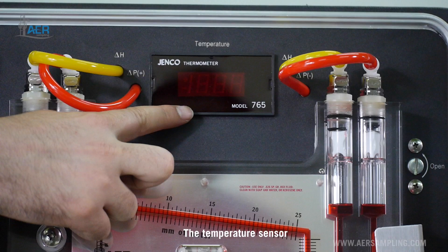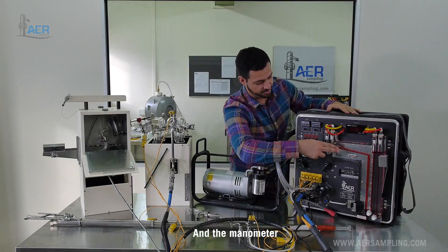The temperature sensor and the manometer.